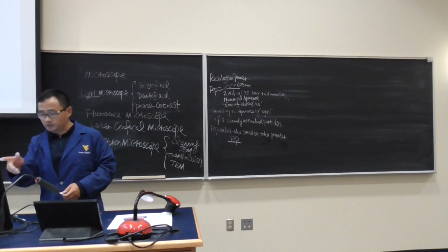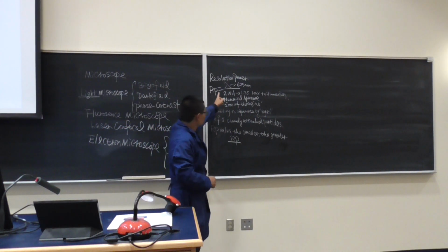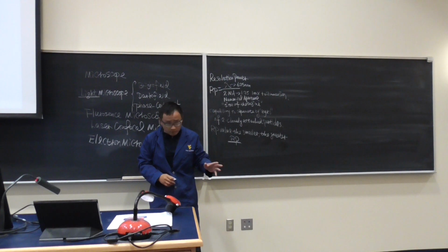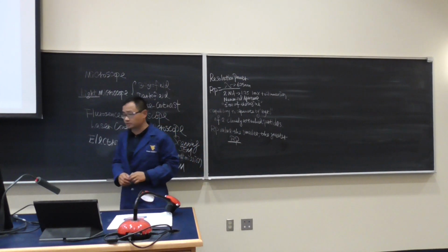And you can see right here, the wavelength of the light is a major factor, because we mentioned lambda 625 nanometers is for the bright field microscope. What we did in the lab, we turned it all the way to the largest part, to the end. So that's what the formula talks about.